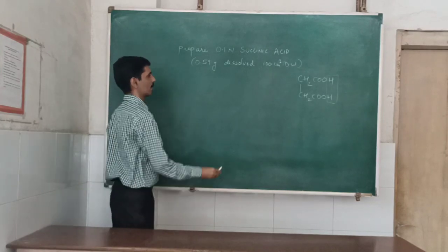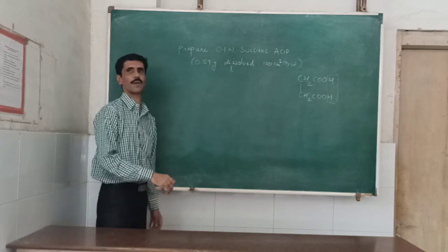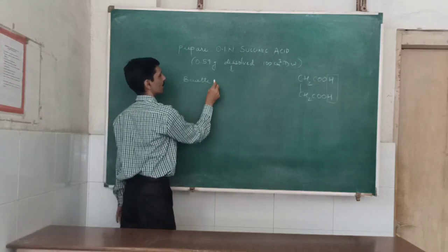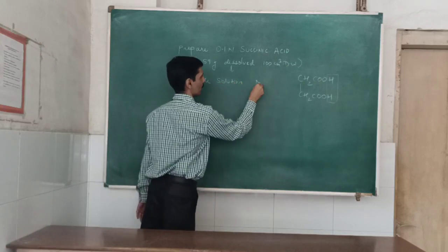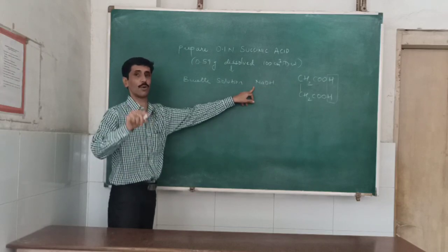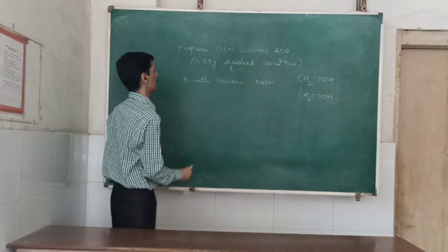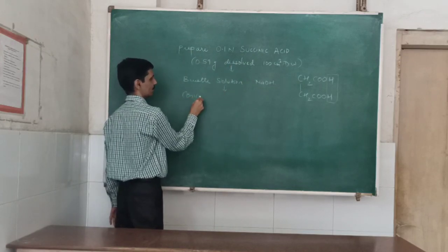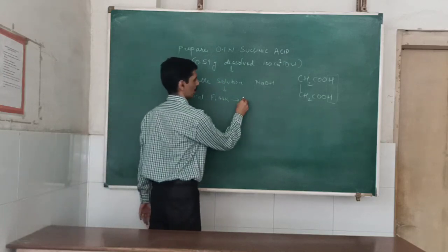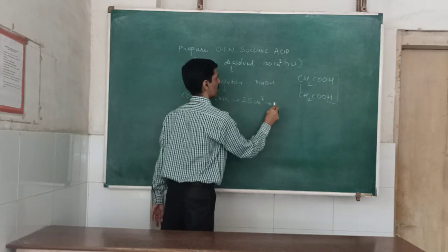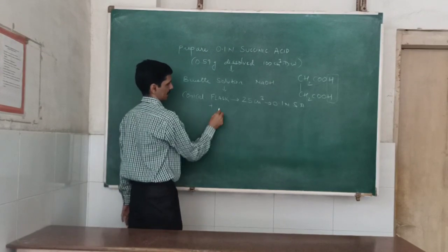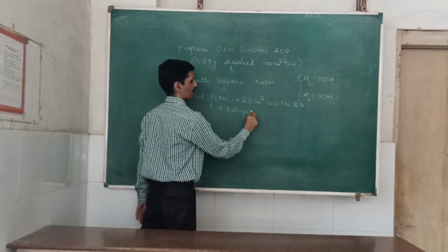Next, we are going to fill the burette solution, and that burette solution is NaOH. The exact normality of NaOH is what we don't know, and that is our aim — to standardize, to find out the exact normality of NaOH. In the conical flask, we are going to pipette out 25 cm³ of 0.1 normal succinic acid. To this, we are going to add 2 to 3 drops of phenolphthalein indicator.